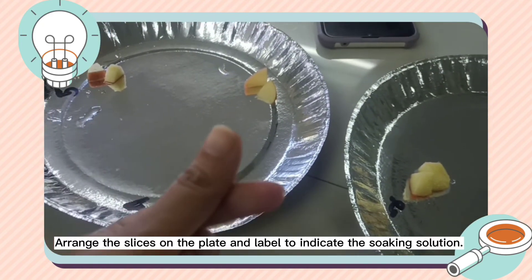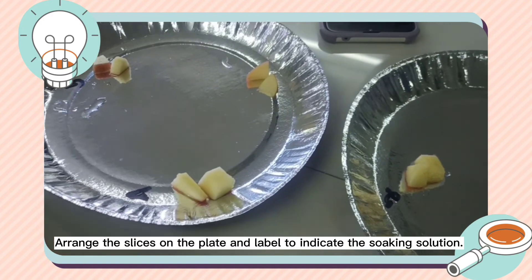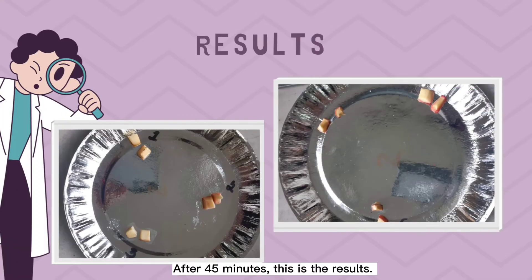Arrange the slices on the plate and label to indicate the soaking solution. After 45 minutes, this is the results.